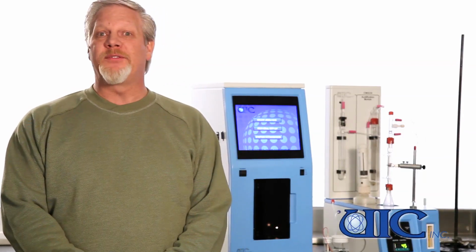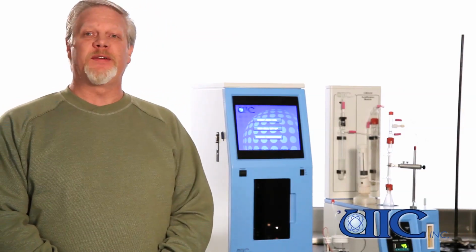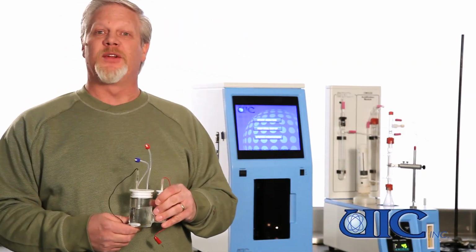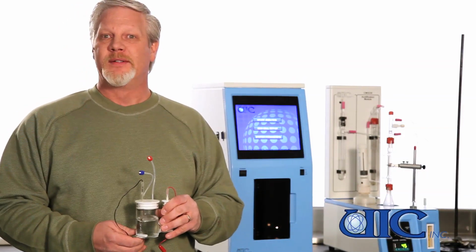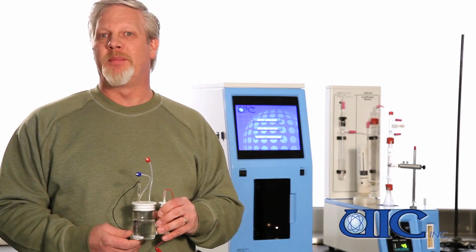The coulometer works mostly on the principle of an acid-base titration. If you remember any of that from your high school or college chemistry, all we do is we take the CO2 from the sample, bring it into a coulometric cell that contains an amine. The amine and the CO2 combine to form an acid. The coulometer then electrochemically generates a base that titrates the acid back to an endpoint.